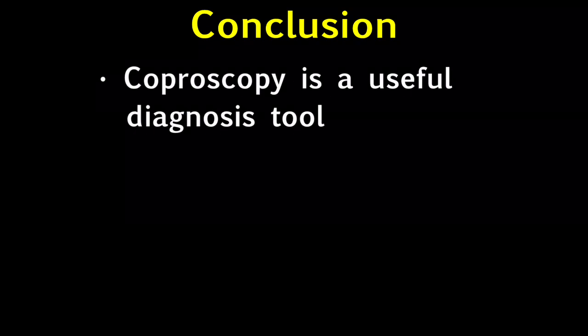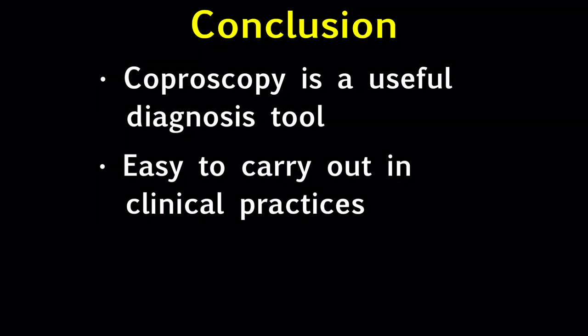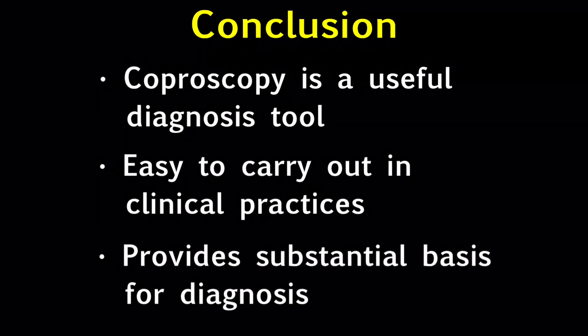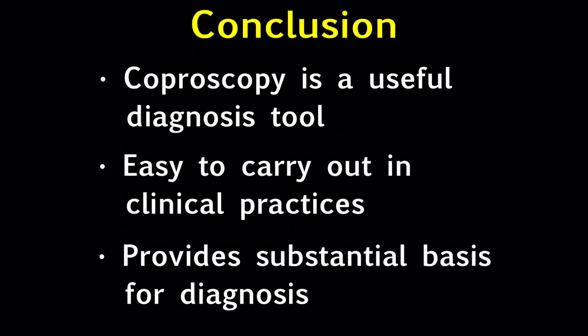In conclusion, coproscopy is a very useful diagnosis tool. It is relatively easy to carry out in clinical practices because it does not require a lot of equipment. It also provides a more substantial basis for diagnosis because in some cases, diarrhea symptoms are not enough information to provide an informed diagnosis.